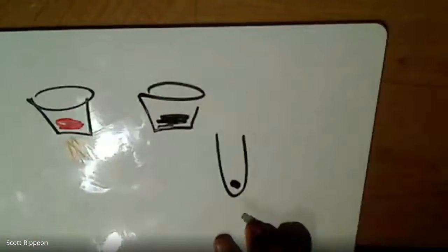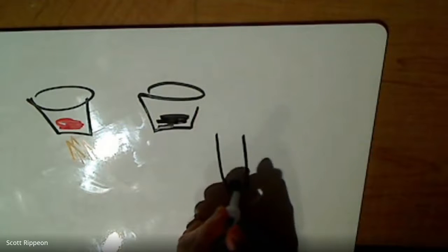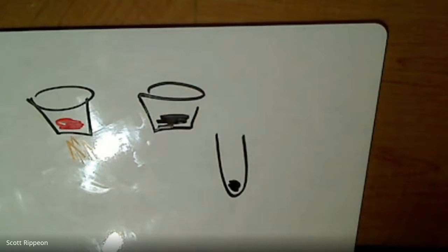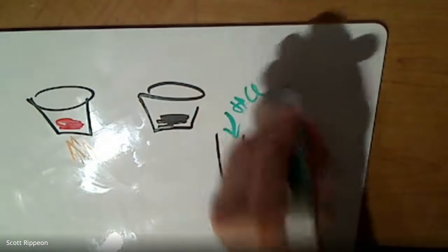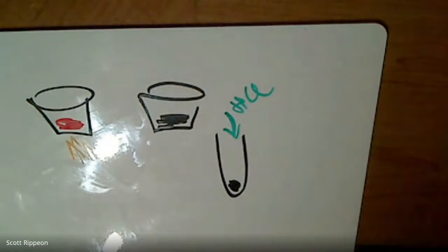Now what we're going to do in the next lab is we're simply going to take that test tube full of that brown copper stuff, because if you remember, it changed from red to sort of a blackish brown. I don't have a brown marker, so we use black. We're going to add a chemical to it, and the chemical we're going to add is hydrochloric acid. The hydrochloric acid will dissolve some things but not others. So we think this might be a mixture of two different things.